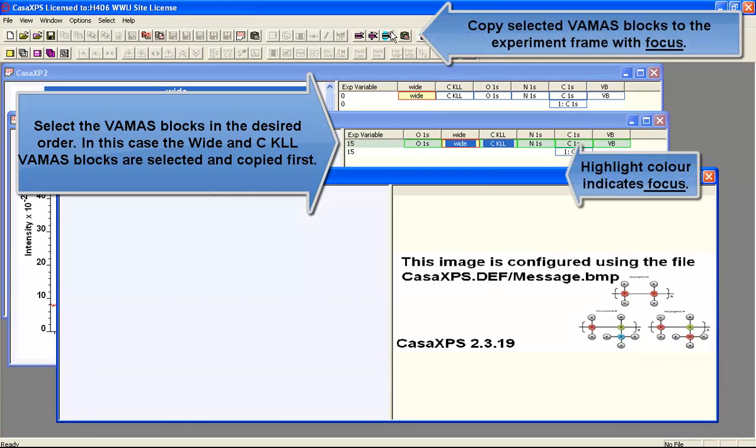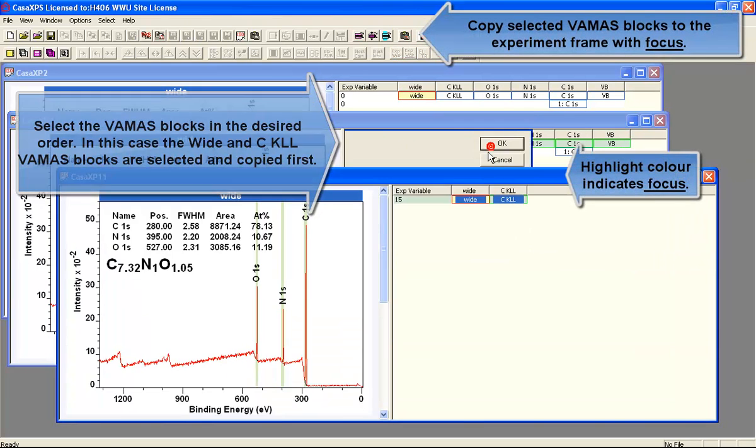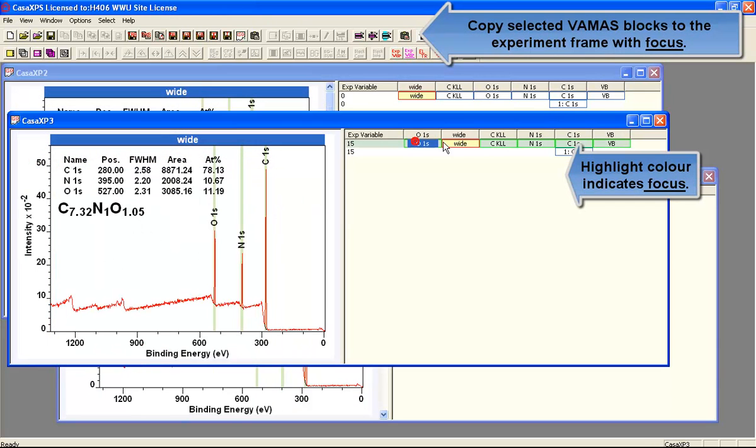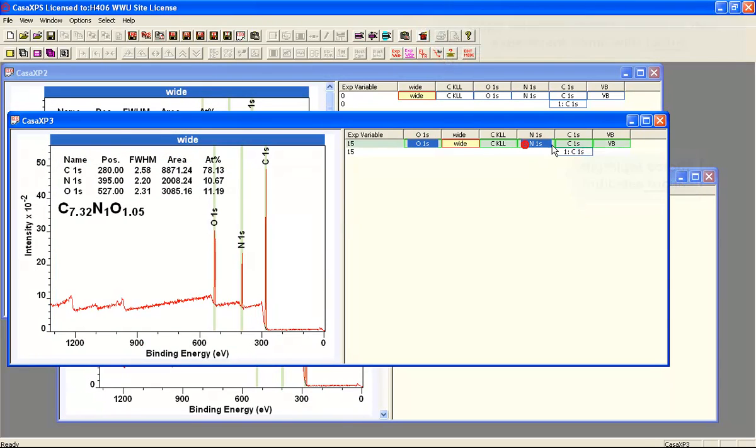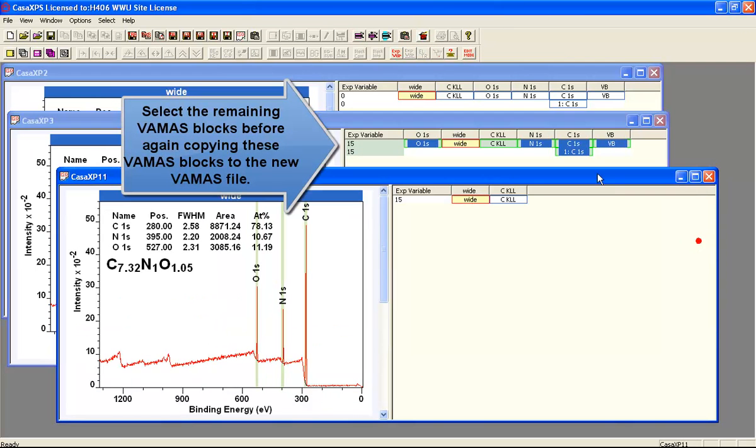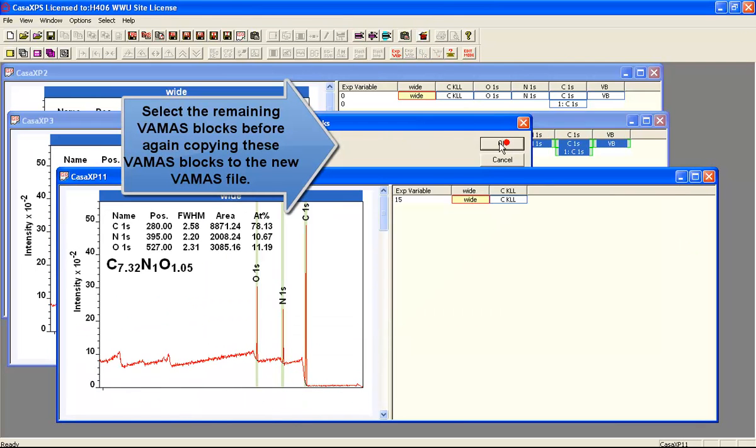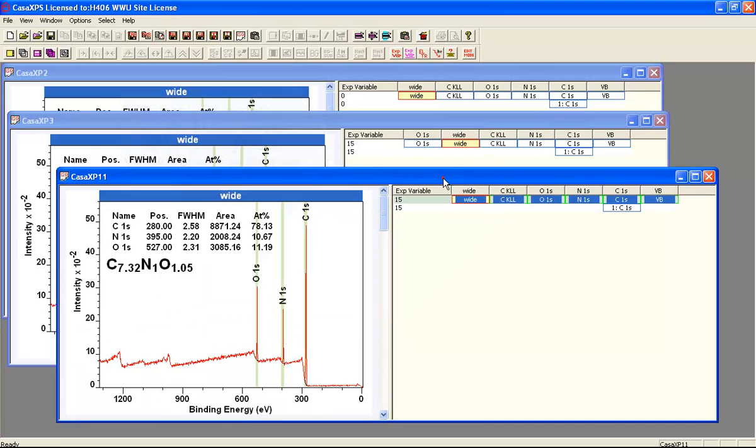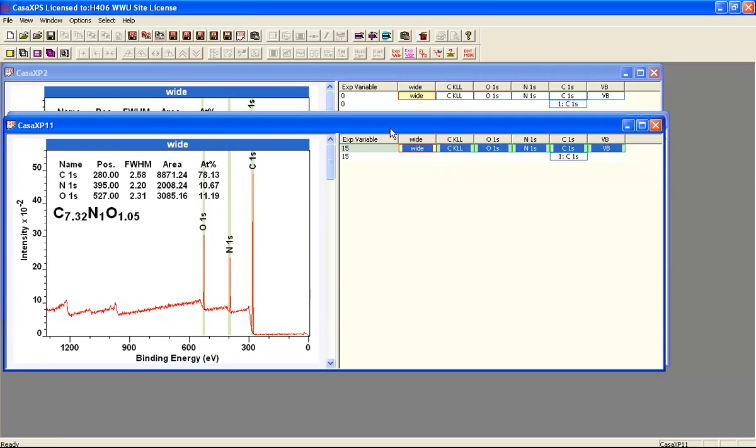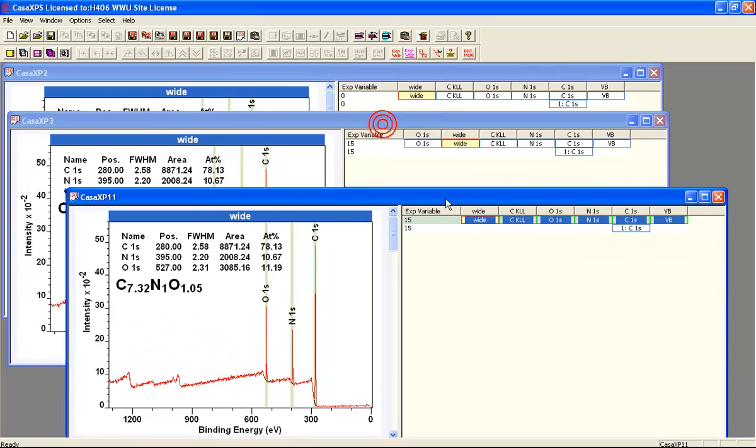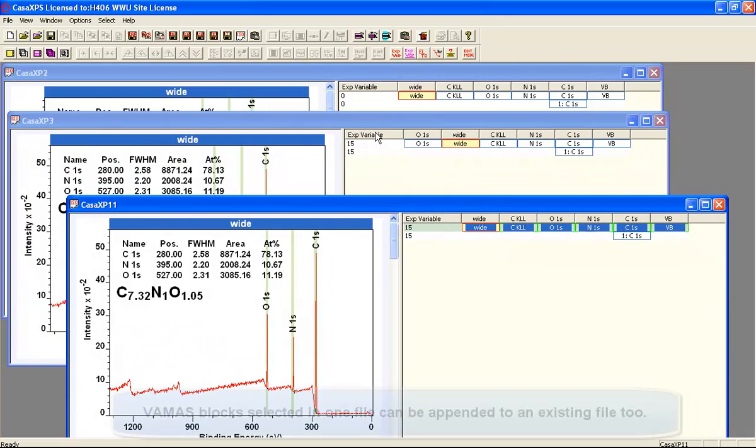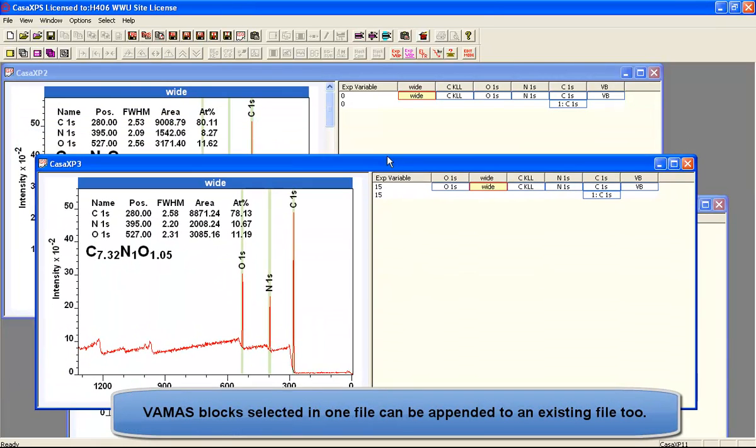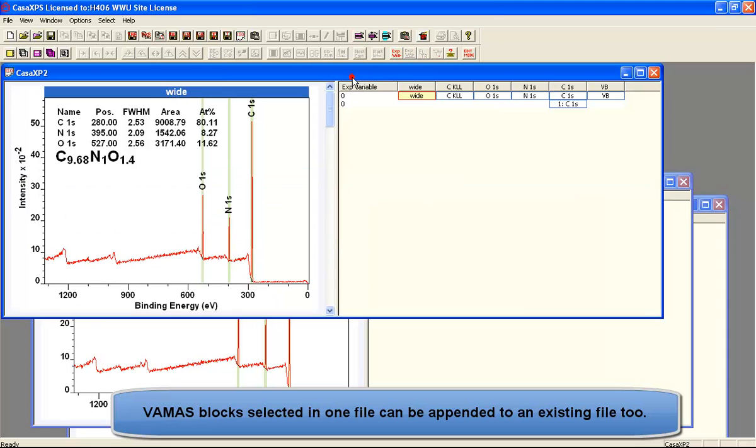One way to reorder the appearance of the right-hand side is to reorder the VAMAS file by copying VAMAS blocks from one file to a new experiment frame. The order of selection and the order of copy will allow you to reorder the VAMAS blocks themselves. You can also use this same mechanism to copy a set of data from one VAMAS file to another.